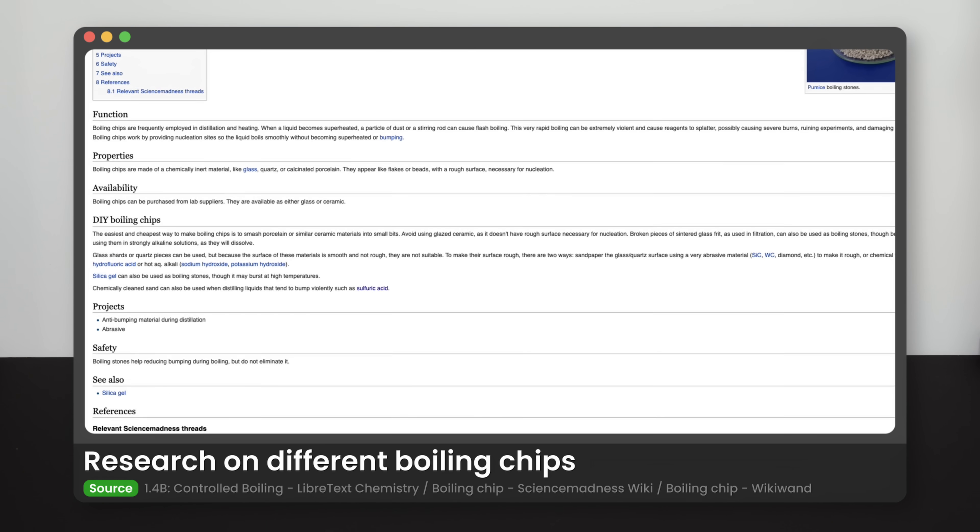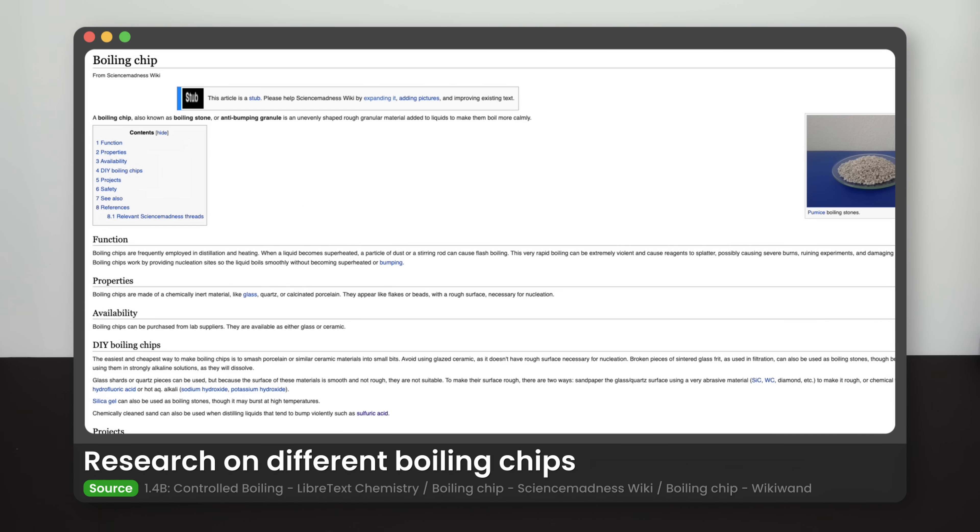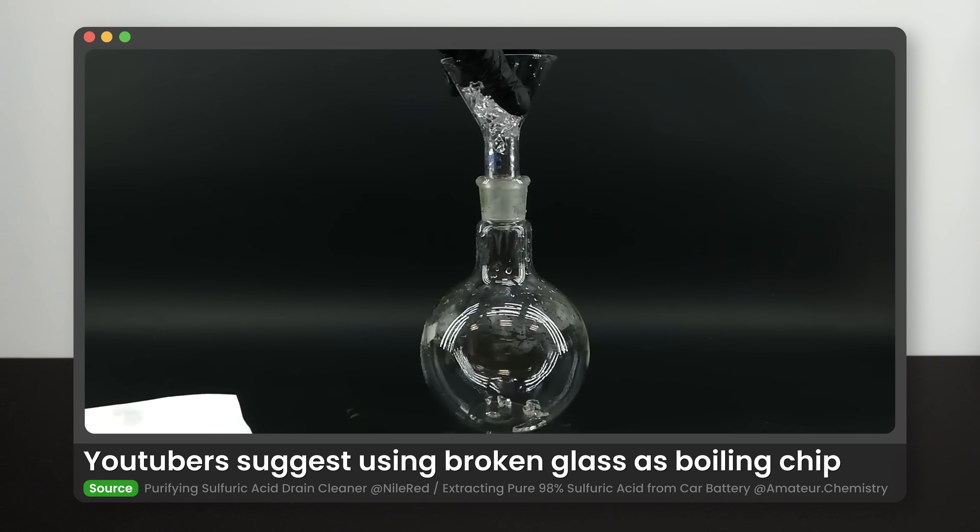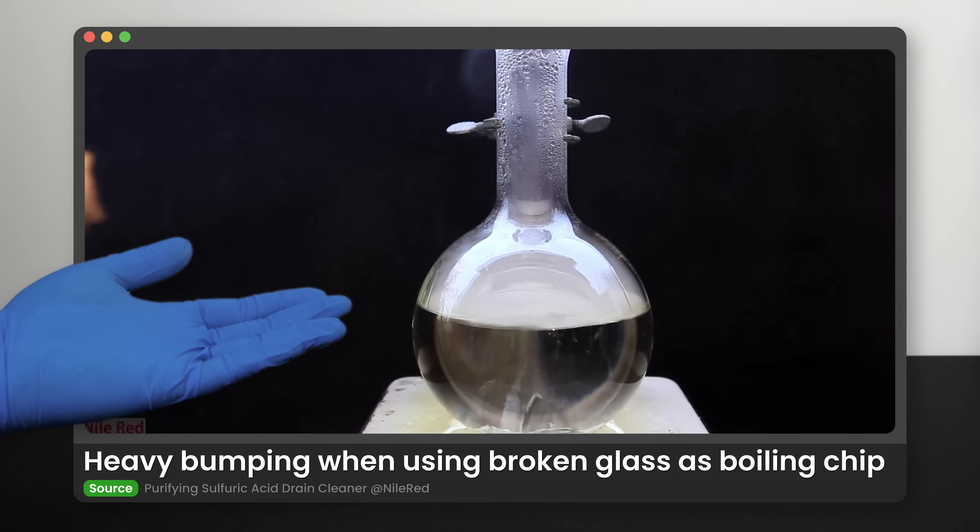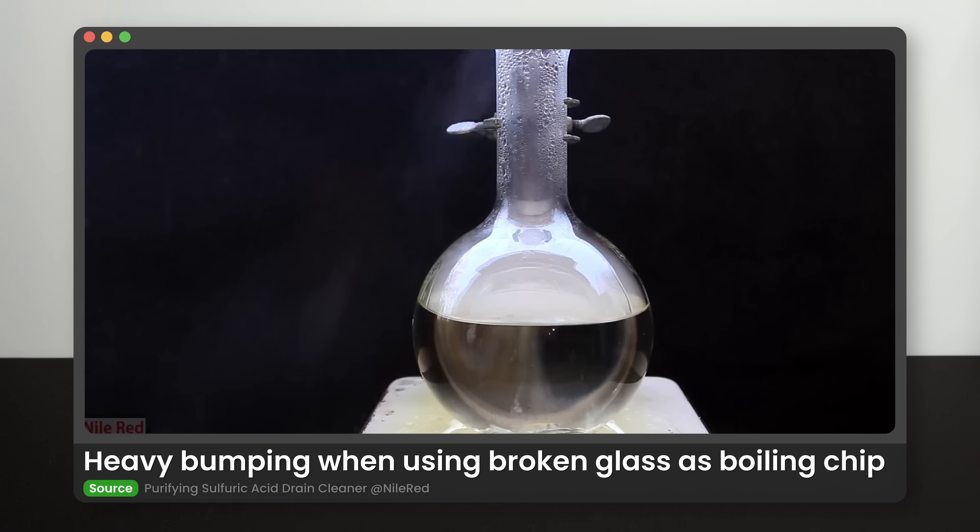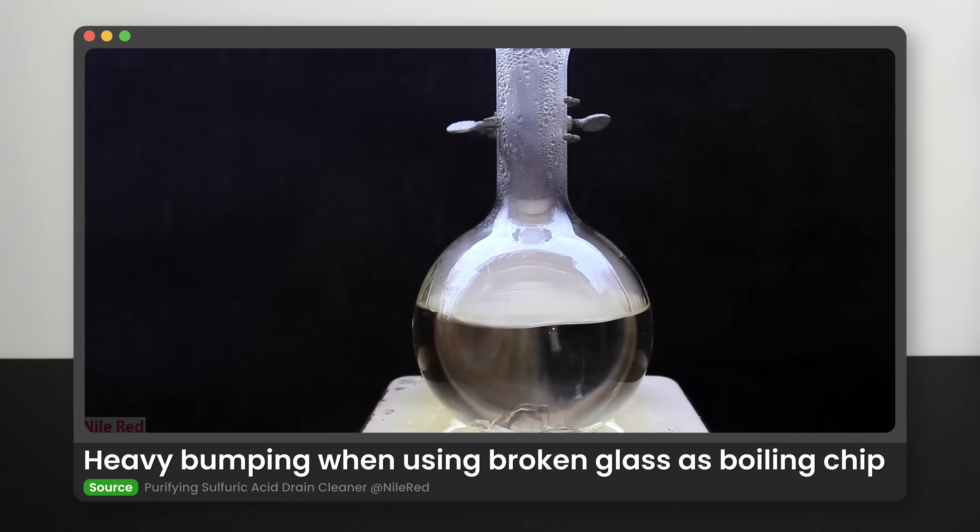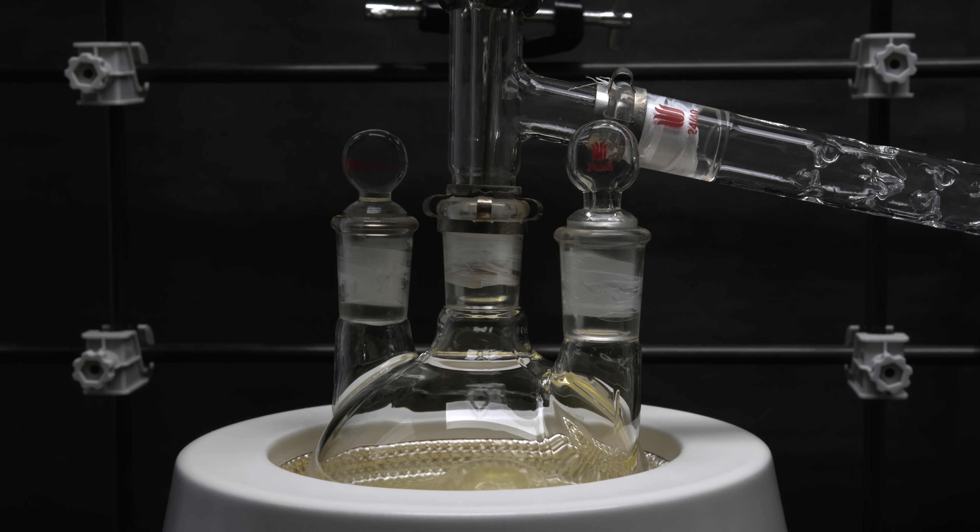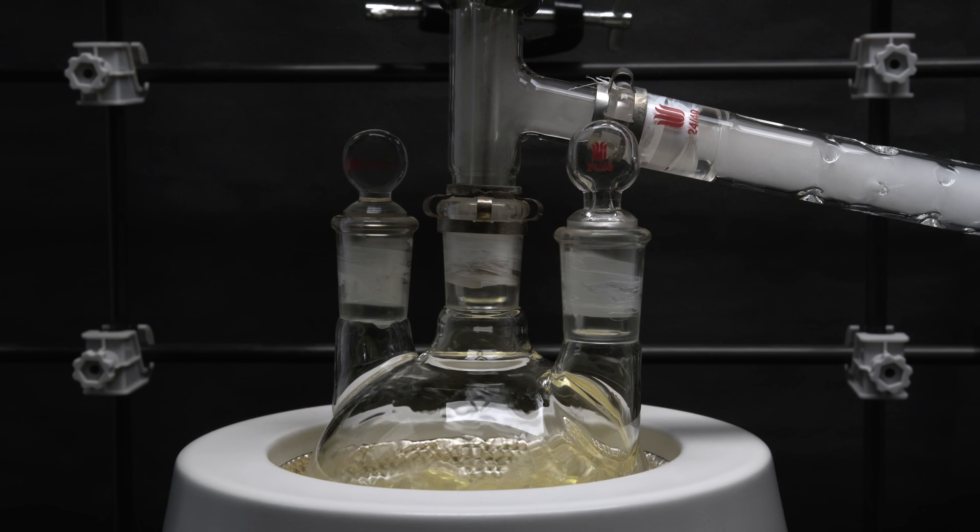But I will also show some of the other boiling chips that I have tested and show you the difference. The first one is broken glass. It is suggested by some other youtubers. But as you can see from their footage and my experience, it just worsens the situation and increases violent bumping. My theory is that the glass not only doesn't provide a nucleation site for smooth boiling to occur, they are even creating uneven hot spots to induce the most superheating spots in the solution.